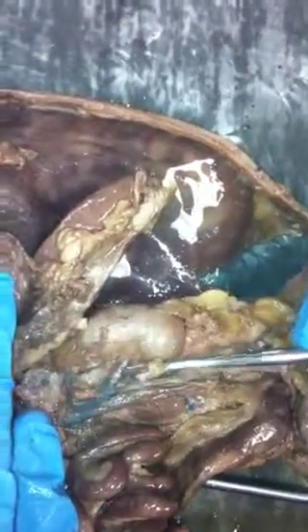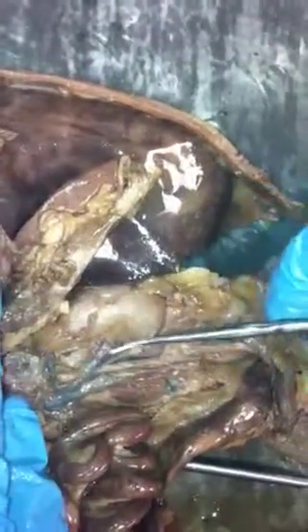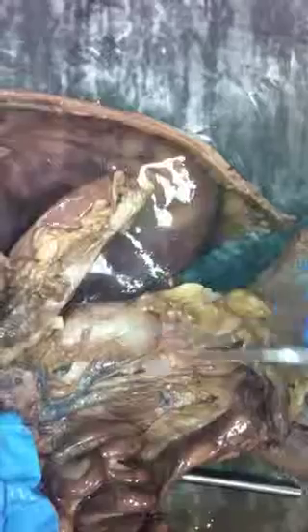Okay, so then we go back to this. We do the cut with the kidneys. Here we go. Adrenal, renal, and gonadal vein. Say it again. Adrenal. Renal, going to the kidney, and gonadal vein.